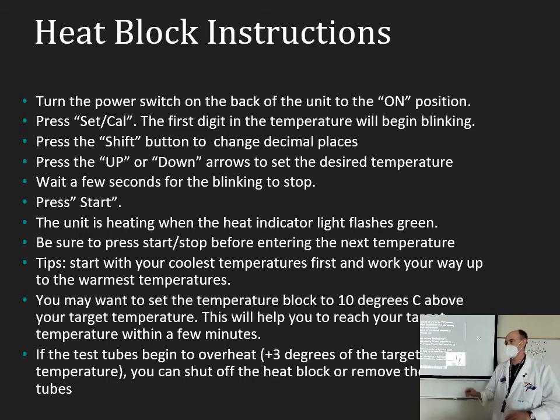You always want to add a couple milliliters of water to each of the wells in the heat block before you use it. The water in the wells will help transfer heat from the block to the test tube. So you'll put a little bit of water in those wells.